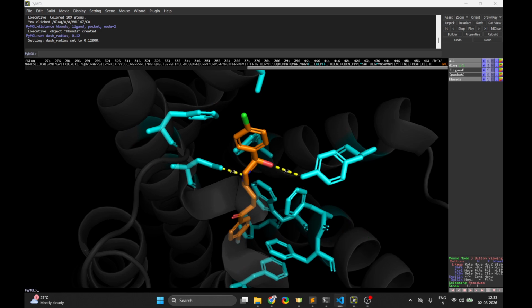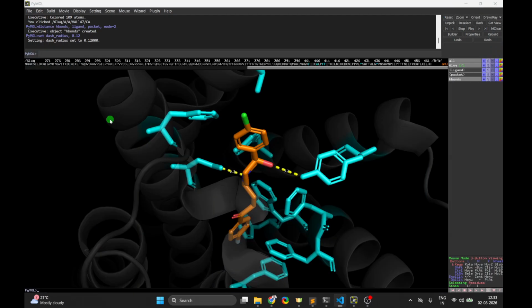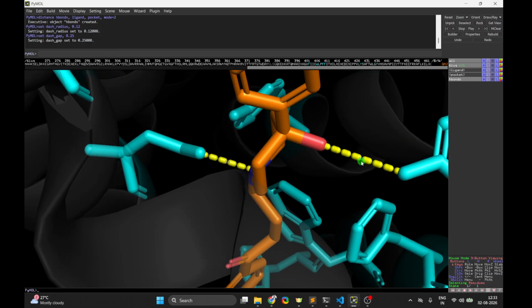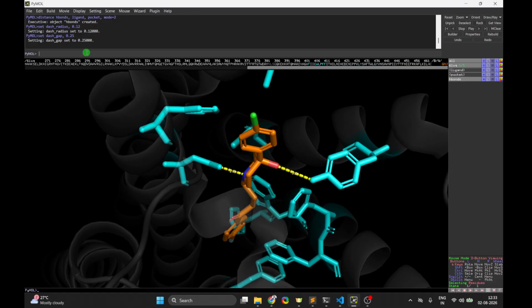And then gap, you can even change the gap that was default, to look a little bit better in appearance. This is the command, which is set dash gap. And you can even change it. I'm just giving you all those commands, and look at that. Now they are much closer, right? So it's visually more appealing, as you can see over here. Default value is not good.